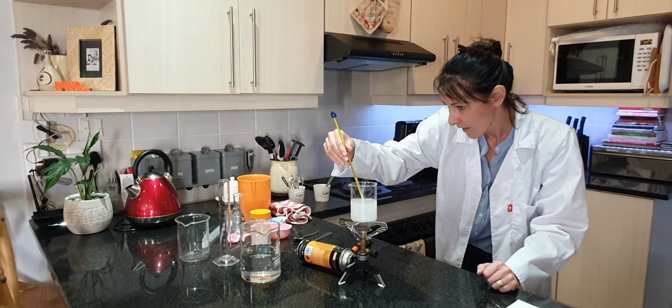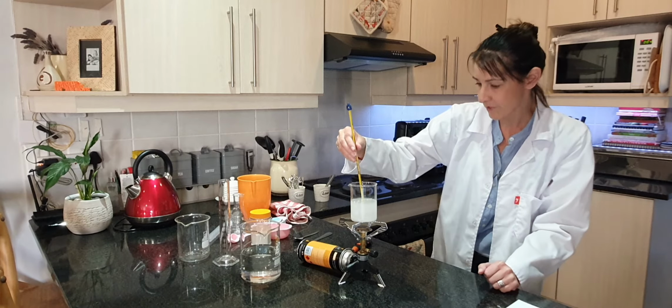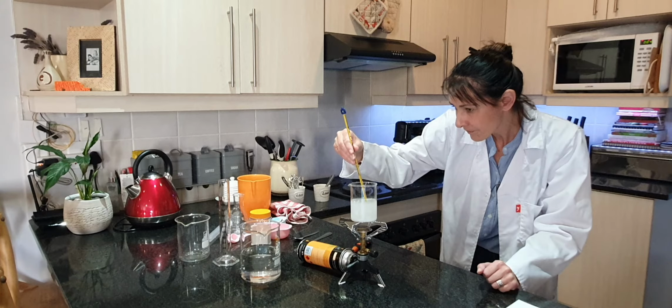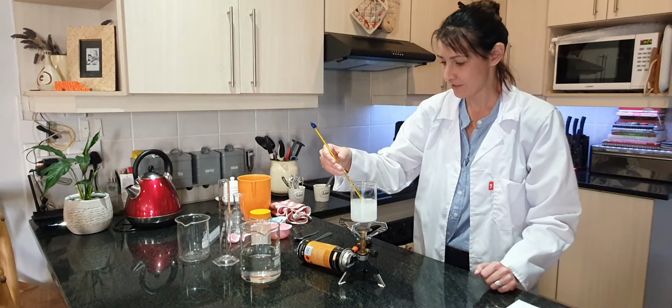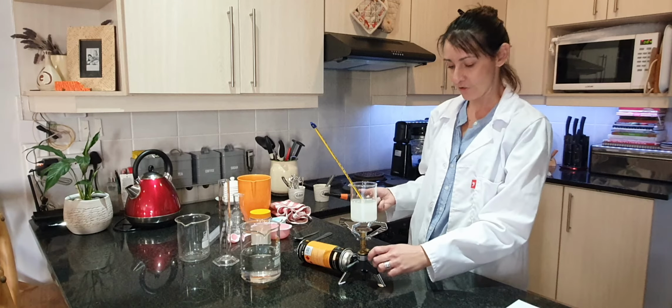Okay. 22. Let's see if we can get a 21 or a 20 from this one. Okay, it seems like it is stuck on 22 degrees Celsius. So now that we have our starting temperature, we are ready to go.